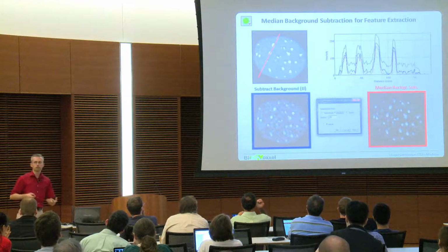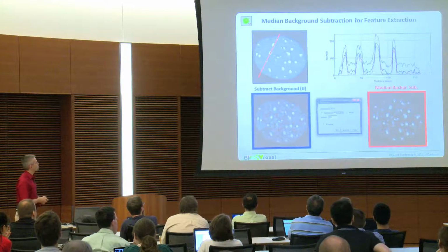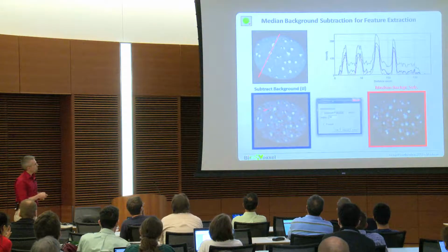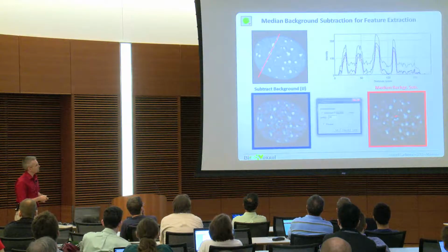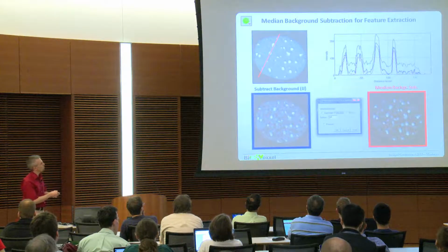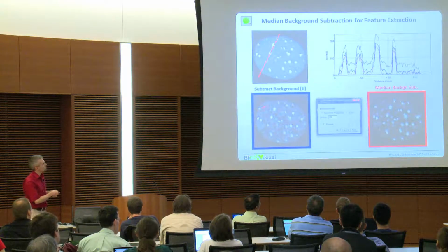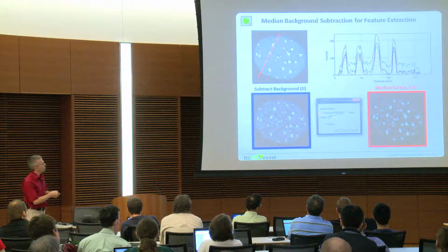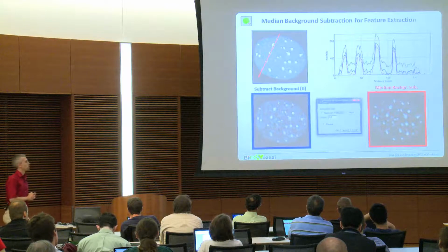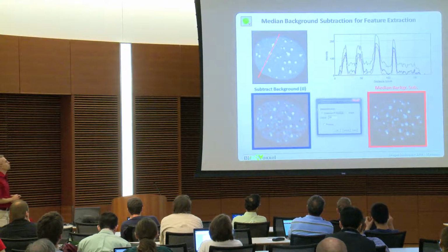So this is, as already said, in the eye of the observer. Here I would get a lower background subtraction than here, so the particles are visible better and separated better. You see that in between, the blue line is from here, the red line is from this median background subtraction, and it pushes the background in between the particles down a little bit stronger.